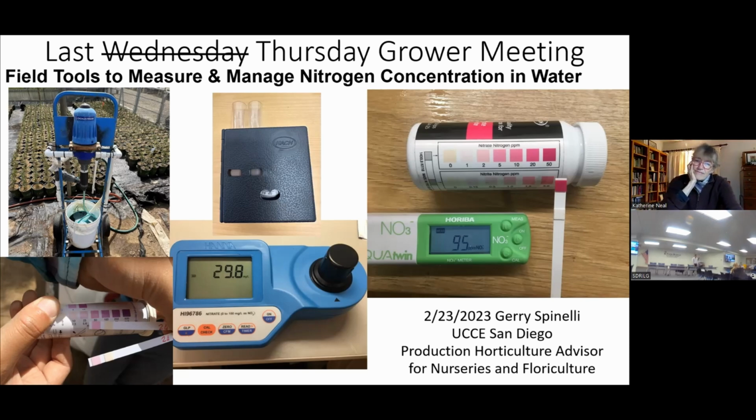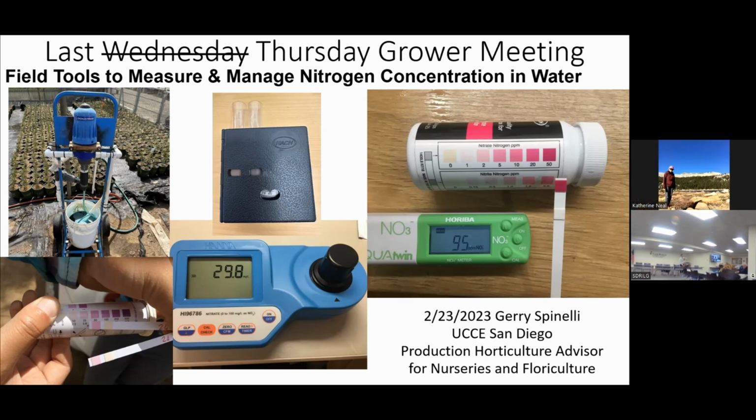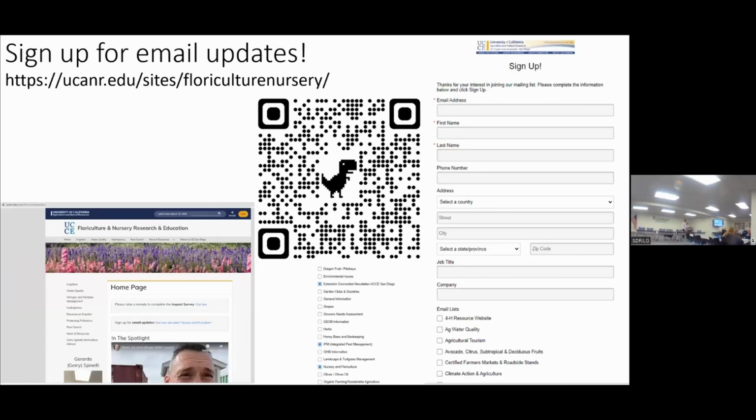But today we're going to talk about field tools that you can use to measure nitrogen and nitrate in the field. And so I'm going to give a 30 minute introduction about units and about concentrations and about electrical conductivity and about boring stuff. And then the other 30 minutes we'll play around with water and various concentrations.